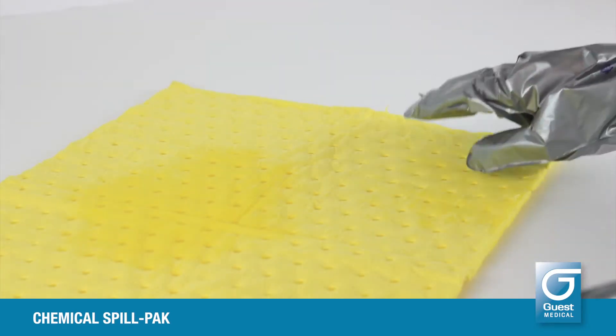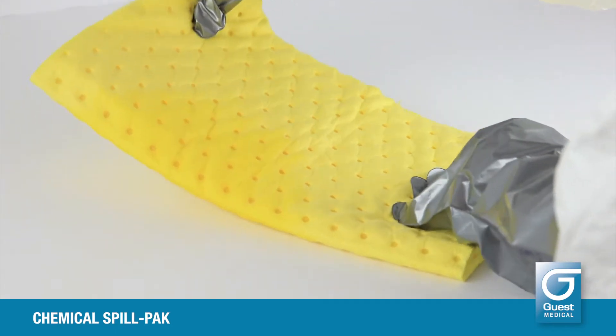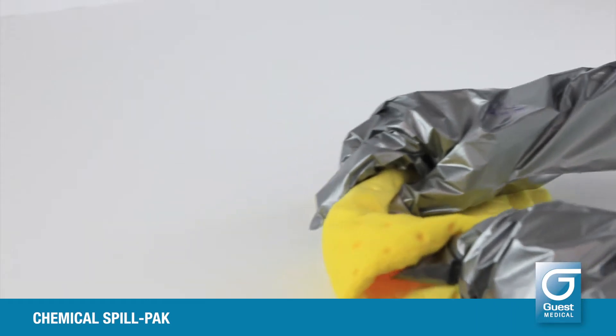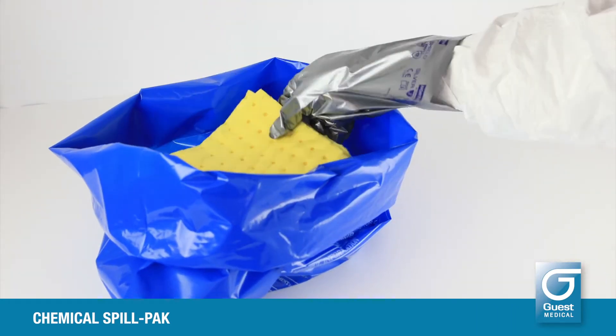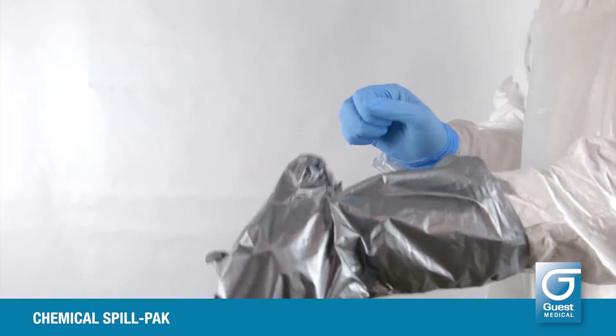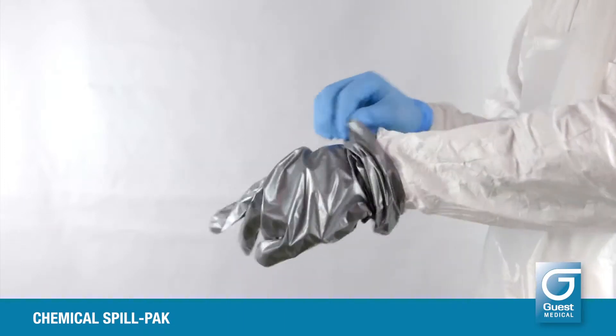Carefully ensure all the liquid of the spill is absorbed. Once completely absorbed, carefully transfer the yellow pad to the hazardous waste bag. Discard the chemical resistant gloves into the blue hazardous waste bag, but keep the nitrile gloves on.